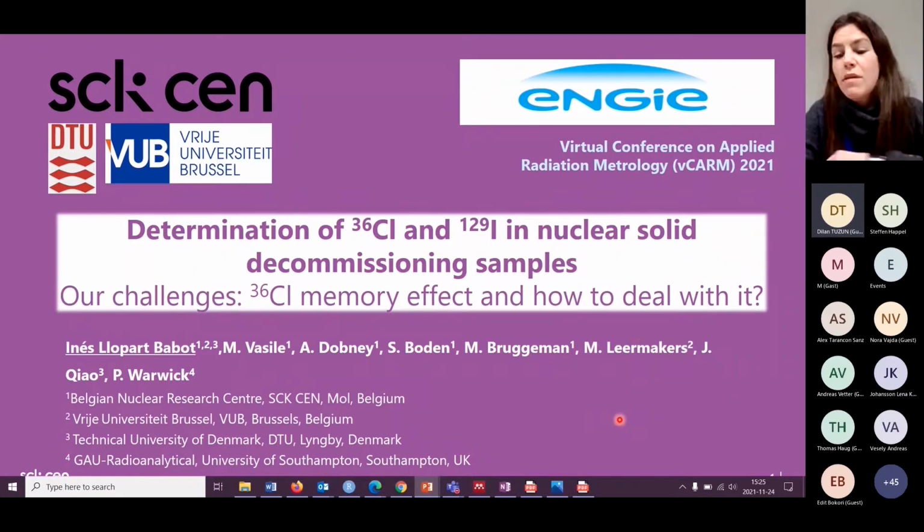So, hello everyone. I am Inés Llopart, a PhD student from the Belgian Nuclear Research Center. First of all, I would like to thank you for the opportunity to present my project at this group meeting. So today I would like to talk about the determination of chlorine 36 and iodine 129 in nuclear solid decommissioning samples, mainly focusing on our big challenge, that is chlorine 36 memory effect and how to deal with it.